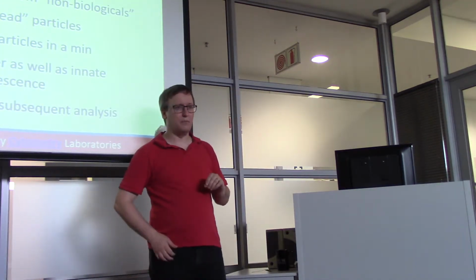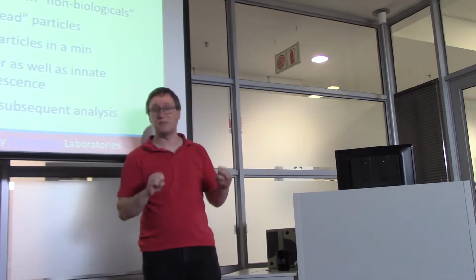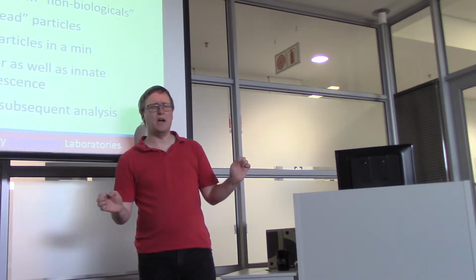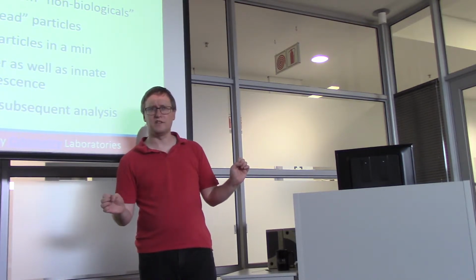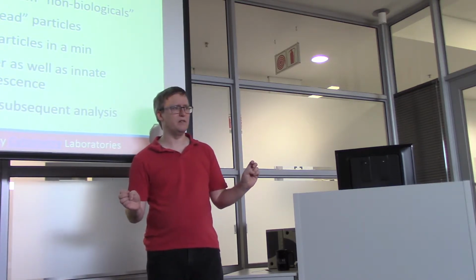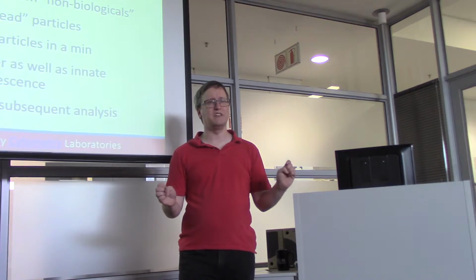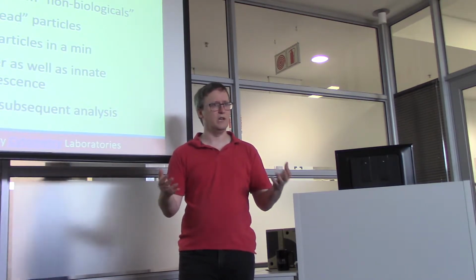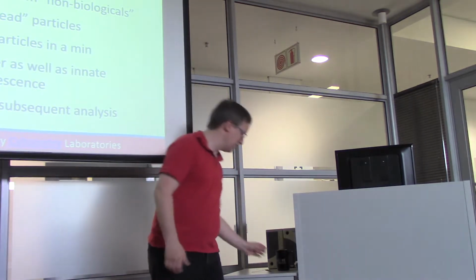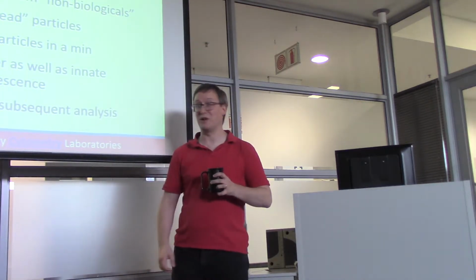All right. Now, before we just blow right ahead, I want to stop and see, are there any questions about things like registration and segmentation, motion analysis, and quantitation? Are those pretty clear? Is the operation of convolution filters sensible? Does that ring a bell? Remember we talked about those? People remember that. Okay, but maybe a little less comfortable. Do we understand why maximizing the contrast between bright and dark features in an image is necessary to getting the best information from it? Good. Okay. Well, I got a raised eyebrow on that one. That wasn't so great. So maybe even that point could be made better. I'll try.